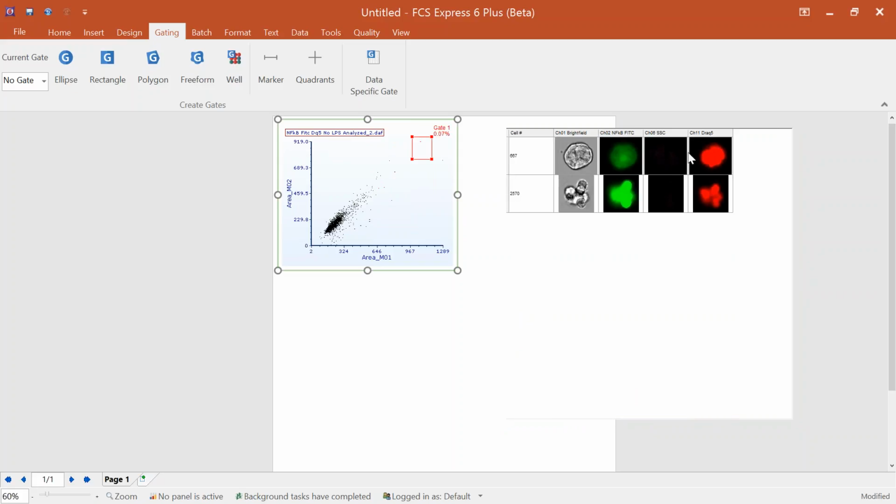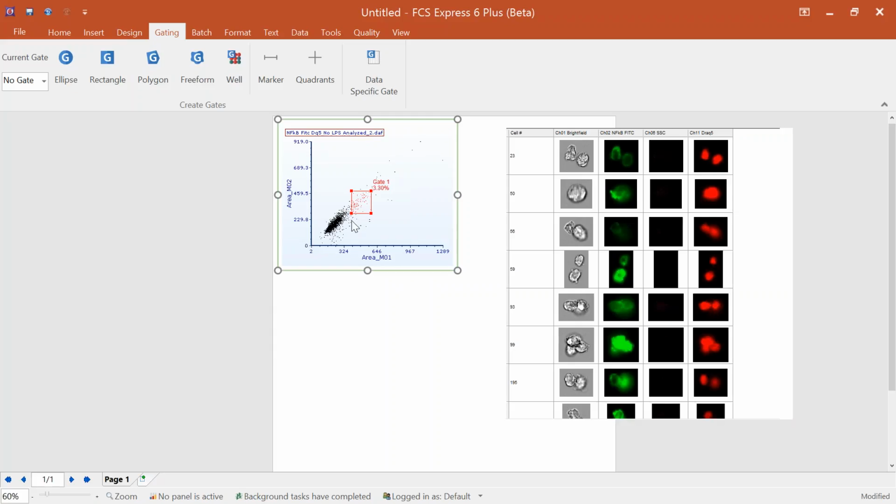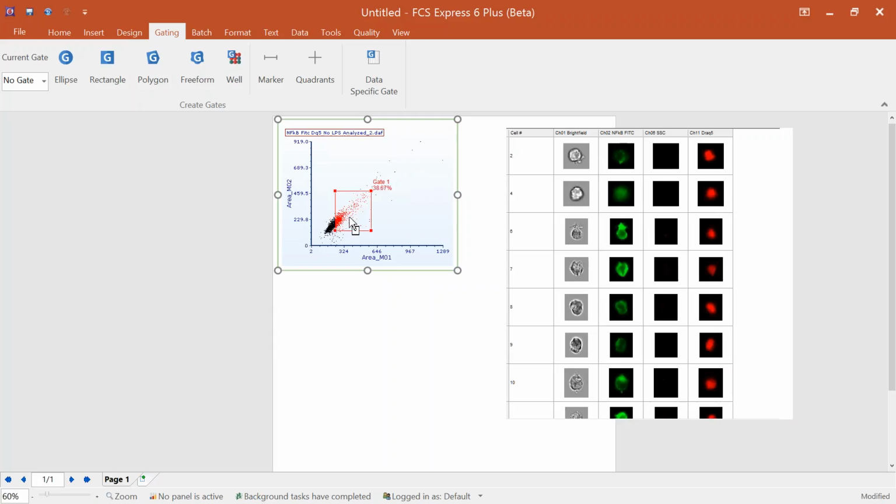So there's a lot of unique things that you can do with this as you're working with your analysis. You get that access to the morphology that Brian mentioned is really important for working with these data sets. With FCS Express now you get the access to the raw data. You can seamlessly work between the two, and we can show you now how to take advantage of some of the high resolution plots and batch analysis features within FCS Express.